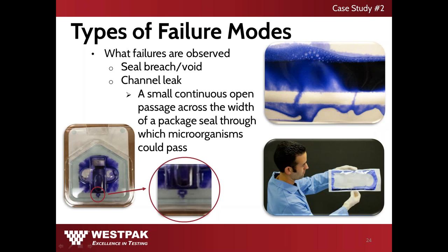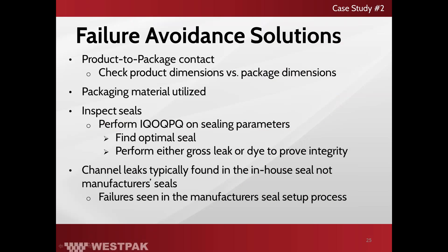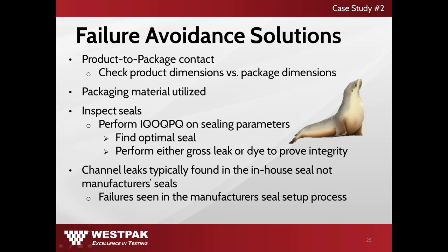The types of failures that can be found during dye penetration testing include a breach or void in the seal. Dye penetration will also detect and locate a leak equal to or greater than a channel formed by a 50 micrometer wire in a package. If you look at our thermoform tray on the left side of your screen, you can see the void identified in the seal. Recommendations to protect and ensure sterility are similar to those mentioned for gross leak detection — it is important to consider product-to-package contact. For instance, a pouch that is too small could cause a device to sit up against a seal, eventually causing a seal creep. It is also important to perform IQ/OQ/PQ on sealing parameters, as channel leaks are commonly found in in-house seals of pouches.